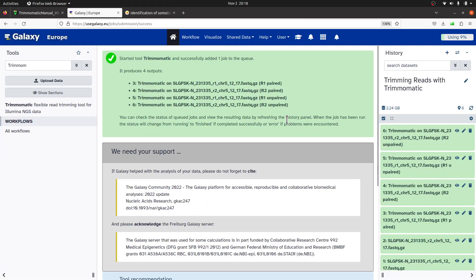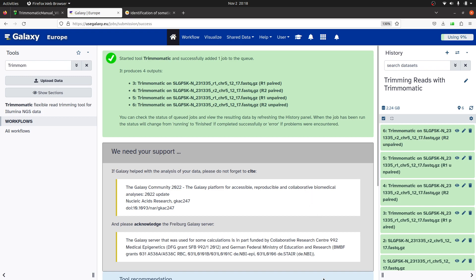So now you know how to perform read trimming using Trimmomatic on the Galaxy platform. I'll be back with another tutorial showing how to use Cutadapt. If you're also interested in watching more tutorials on Galaxy, check the playlist right here.